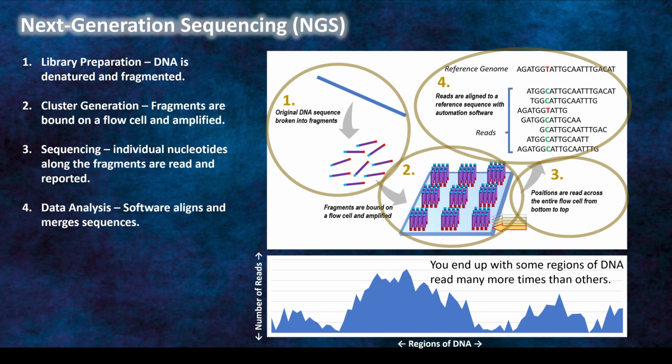This basically takes the idea of Sanger sequencing and multiplies it by a million or 10,000. It's taking very short reads, so it's breaking our DNA into very small pieces and reading small sections. The reads are typically anywhere from 100 to 150 base pairs in length. We'll talk about what that means in a second because that does vary greatly between these types of testing, so we'll cover it on its own.